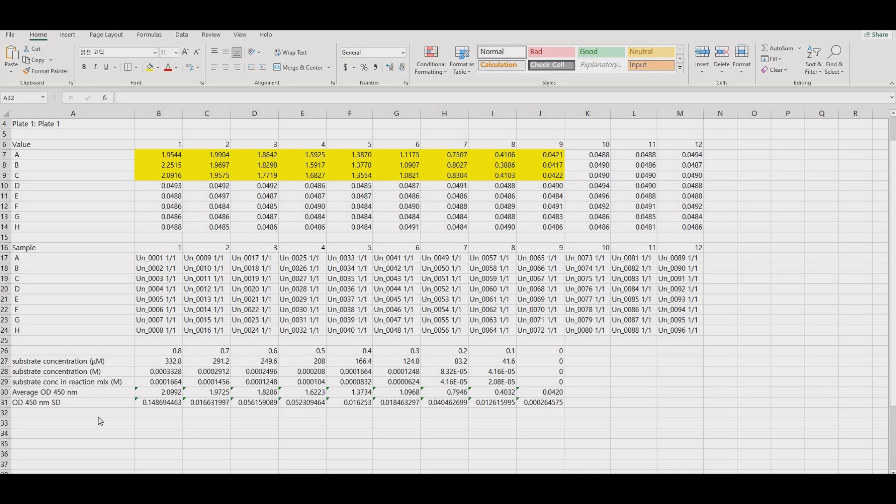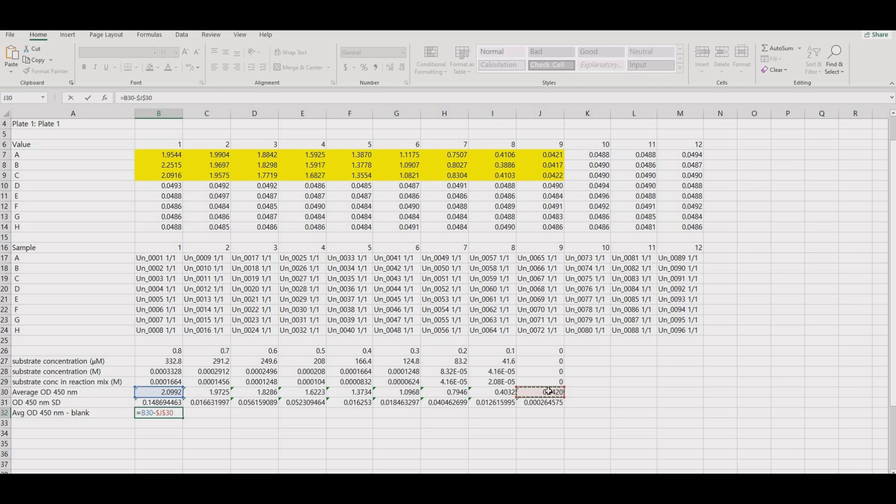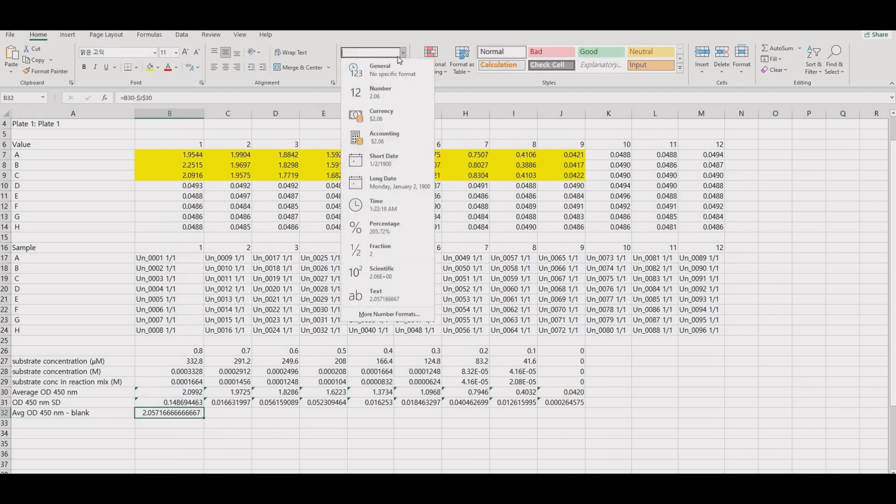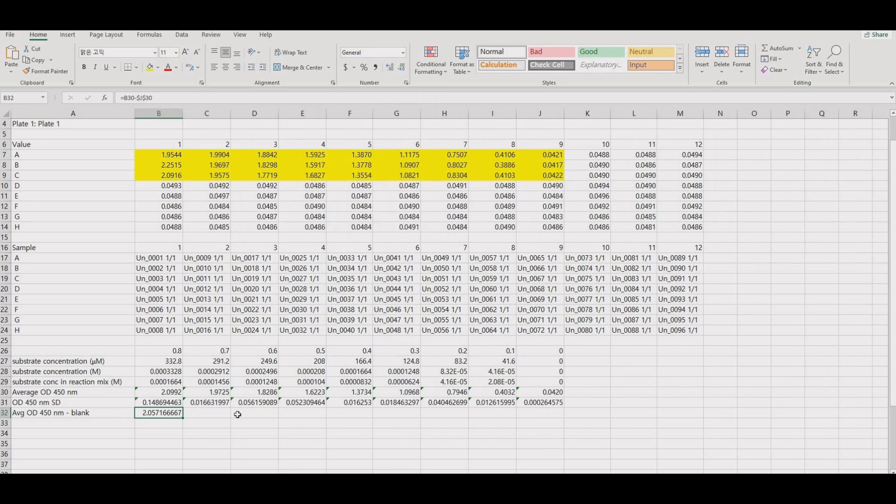Subtract the blank from the other data points. You can fix a data point by pressing F4 or using the dollar sign. Fix the value of the blank so that you can subtract the same value from all the other values.